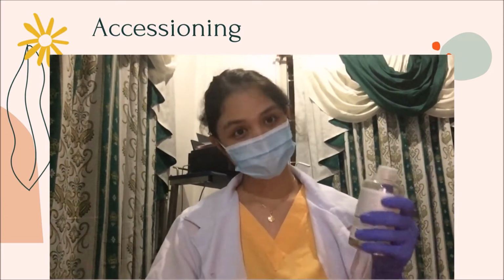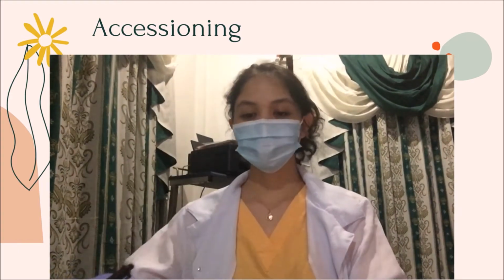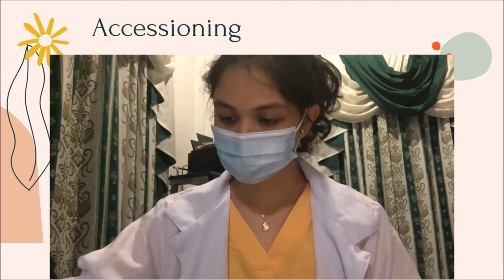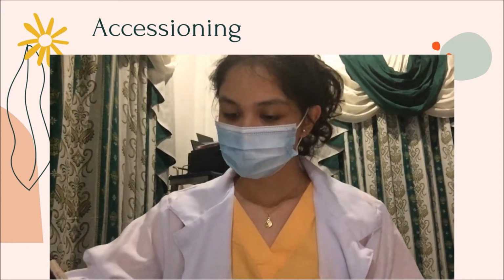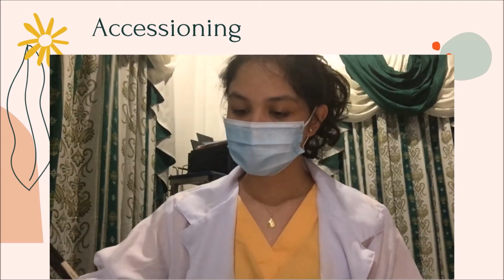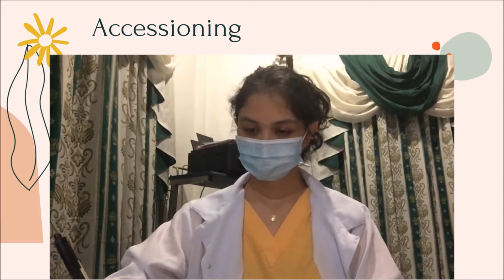So now that this specimen has its serial number, we're gonna document it in our logbook. So we're gonna write down the serial number, which is SP21143, the patient name, age, gender, room number, the specimen, name of the pathologist who will examine the specimen, the date the specimen is received, and of course the due date.